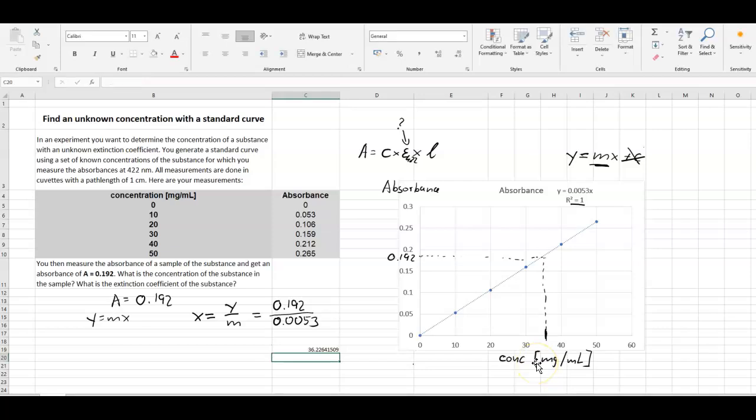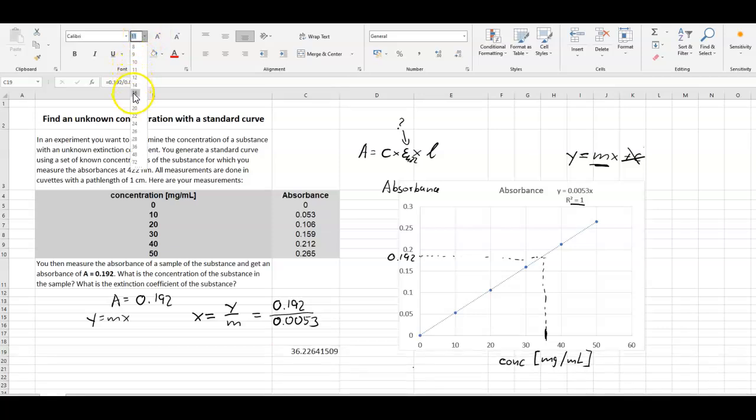And we just simply put that into Excel. We don't need to calculate it ourselves. Let me make this larger. So we would just simply say equals 0.192 divided by the gradient. And that was 0.0053. And we would get a value of around 36. We probably need to be careful with the number of digits after the decimal point. I don't think we can be more precise than this 36. And what's the unit? Well, the unit is, of course, this milligram per milliliter.